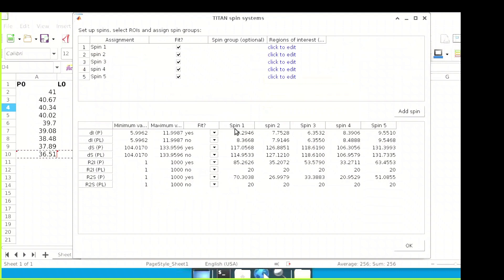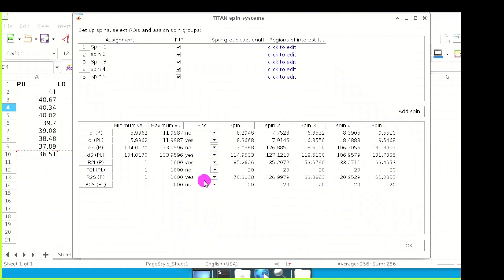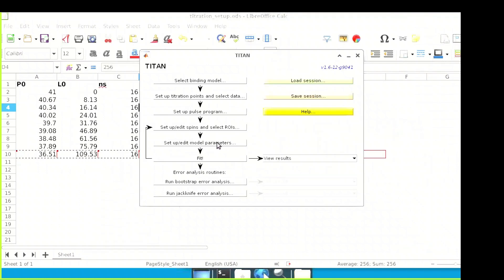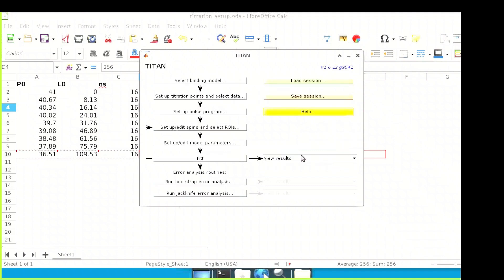Return to the spin editor and turn on fitting of bound chemical shifts and all line widths. Similarly, turn on fitting of the model parameters KD and KOFF. Now run the fitting process again using all the spectra.